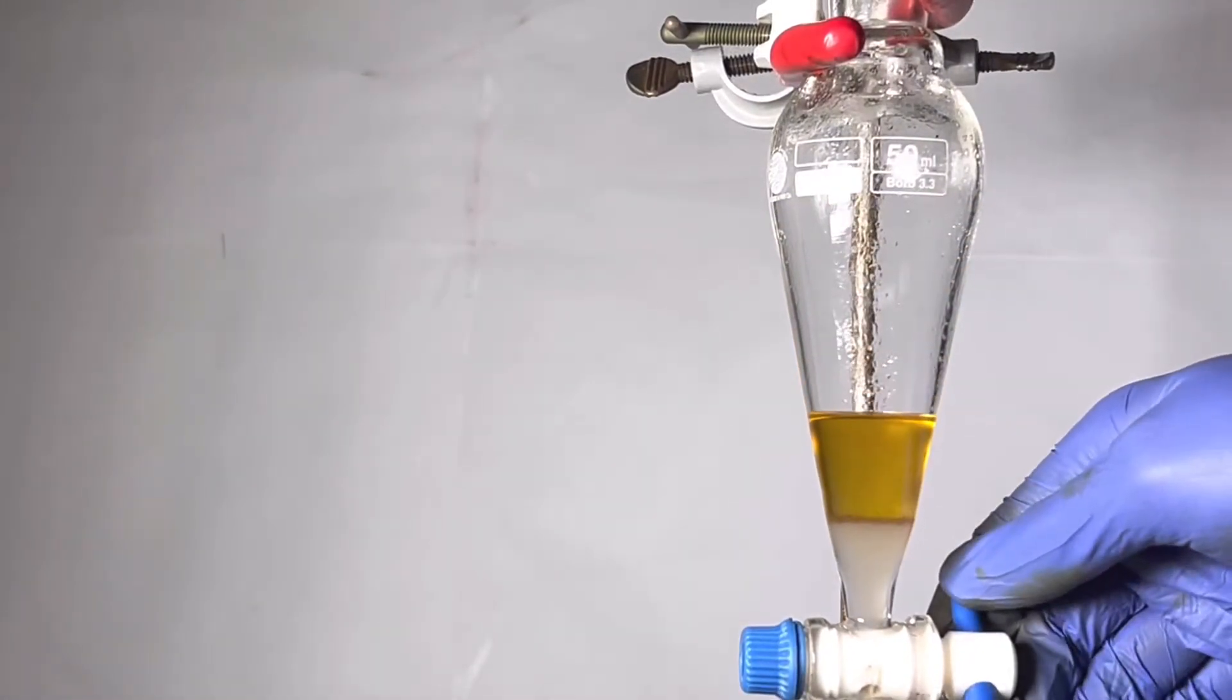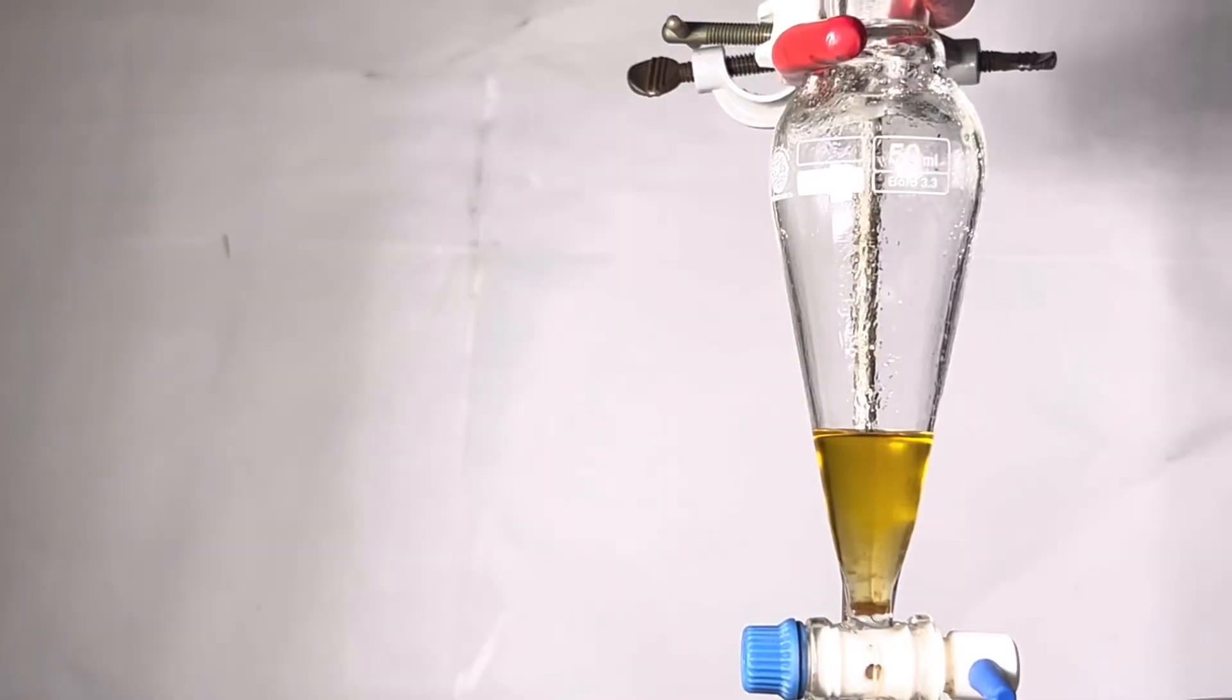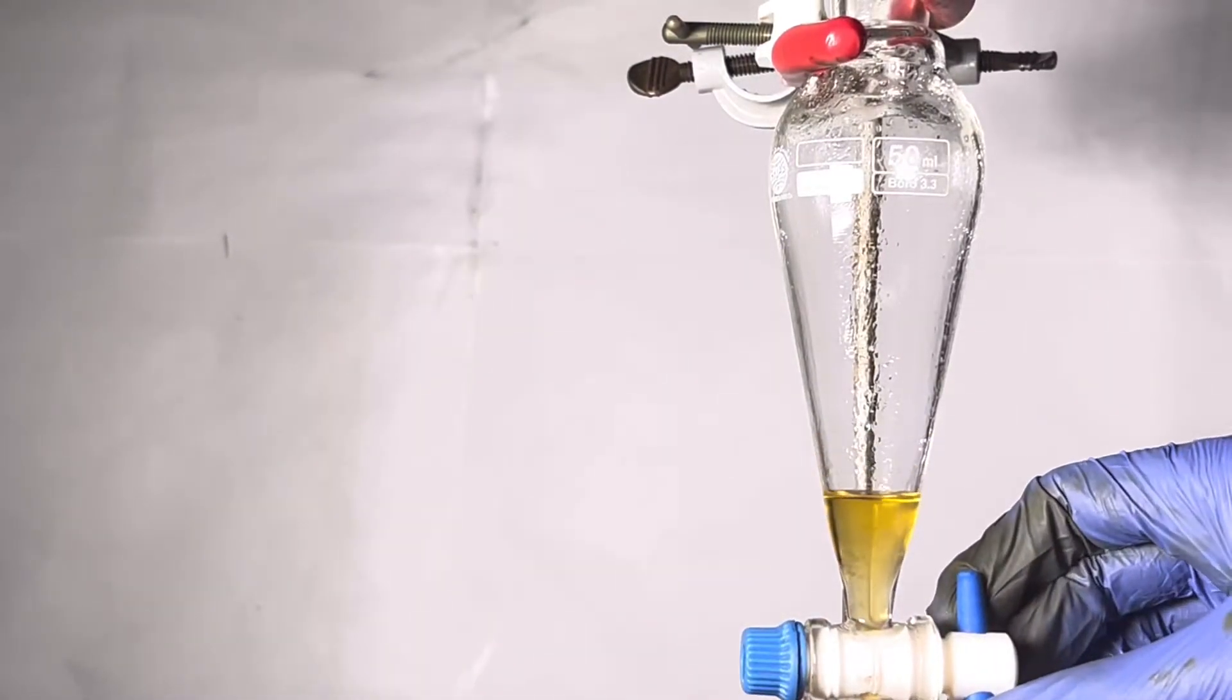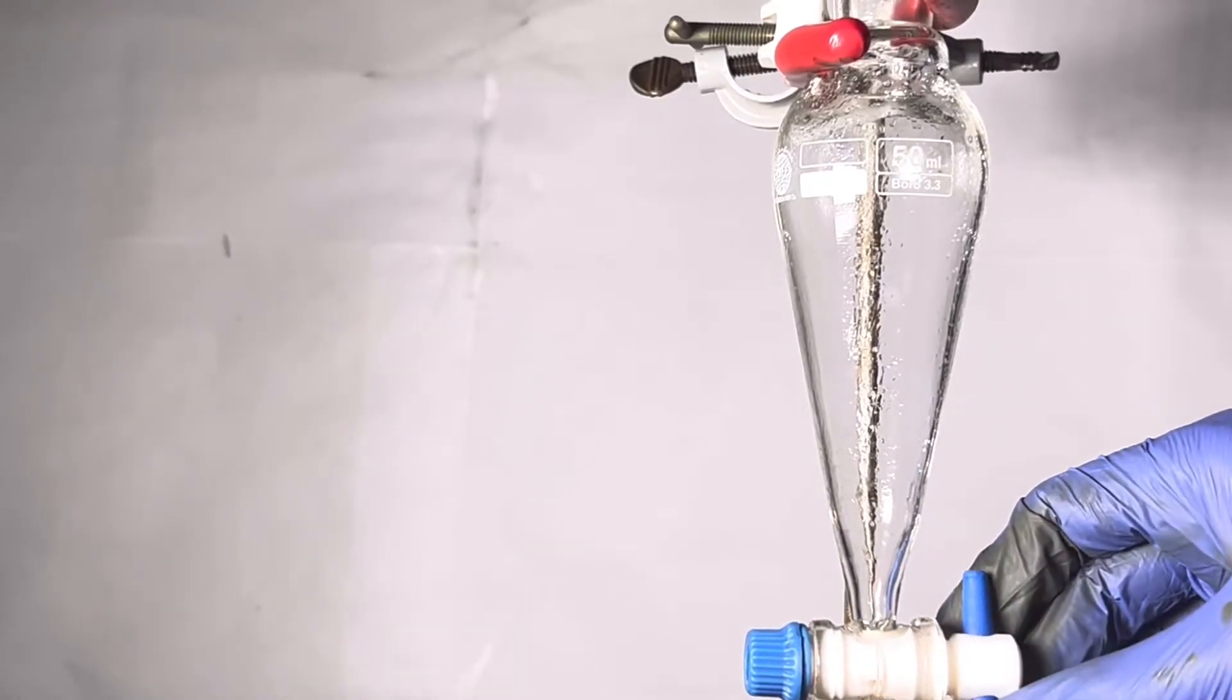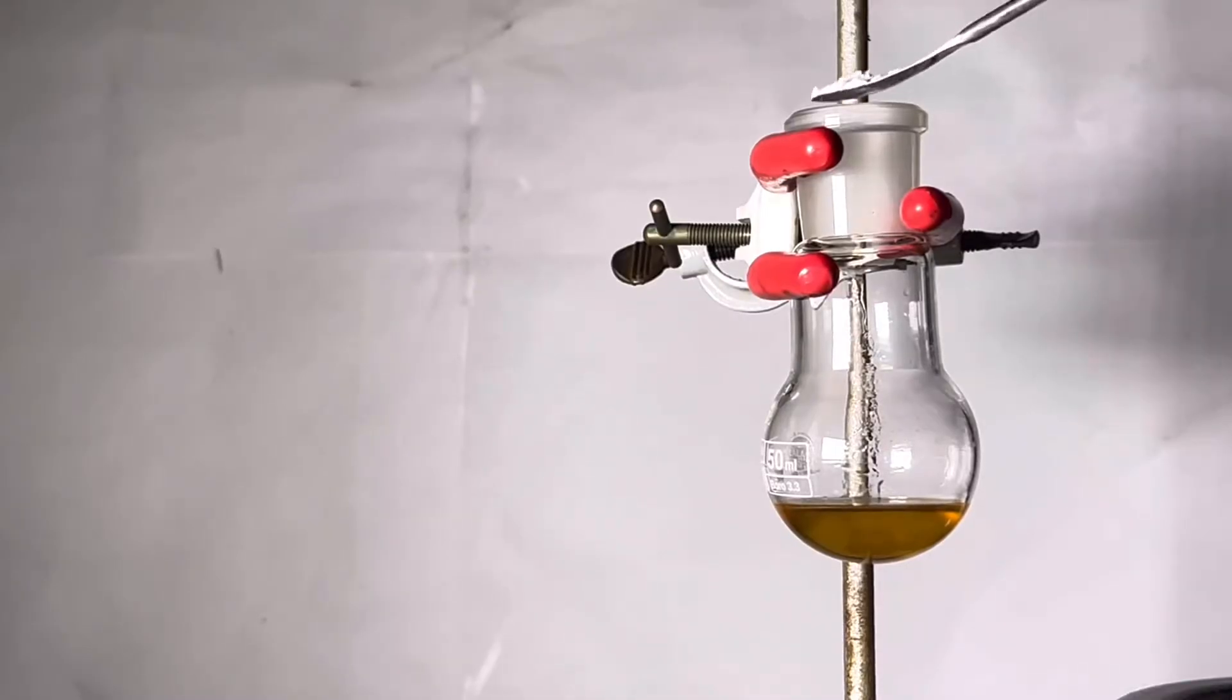Then the upper layer was washed two times with cold water and the valeric acid upper layer was separated from the aqueous layer into a small 50 milliliter round bottom flask. Anhydrous sodium sulfate was used to dry the product.